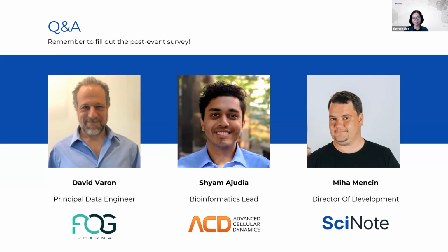Right. I think that's also another thing to make sure of: it is a digital thing, right? So you do need to connect through a digital means. And if your scale does not provide an API or does not have that digital means of communicating, then that might be out of the question, or will be extremely difficult. But if the digital scale does provide some level of API, some support and method of communication, then that's definitely possible. And Miha, do you have anything to add to that?